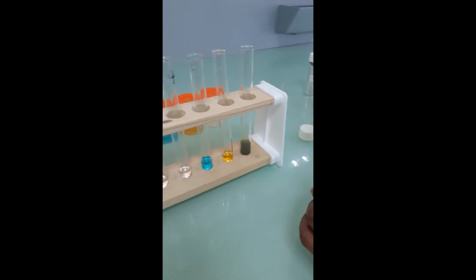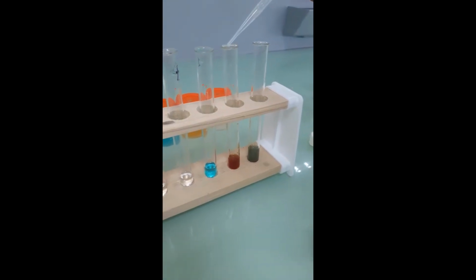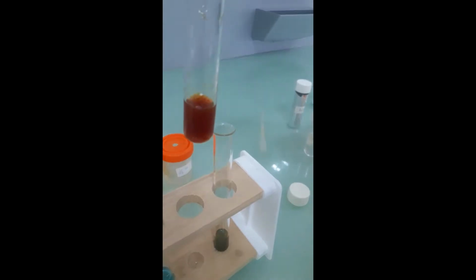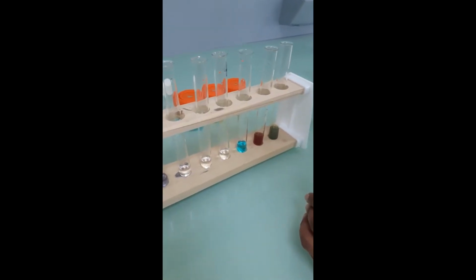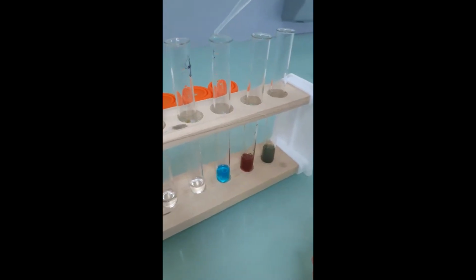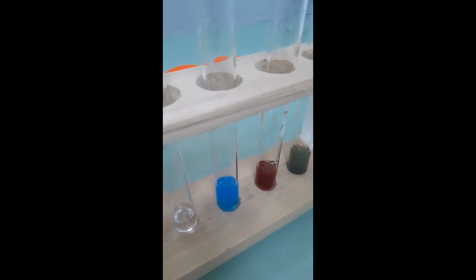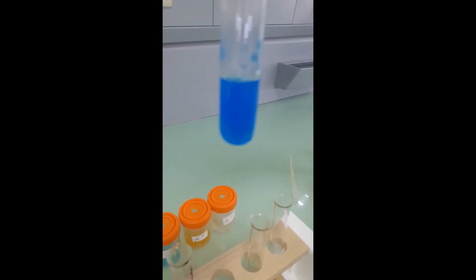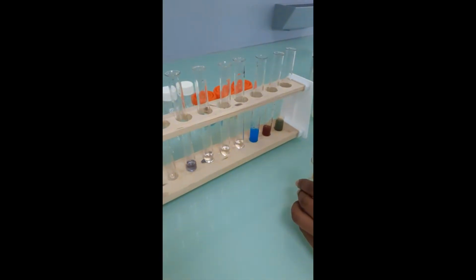Okay, so the next one is Fe3+. Now we have Cu2+. Pb2+.